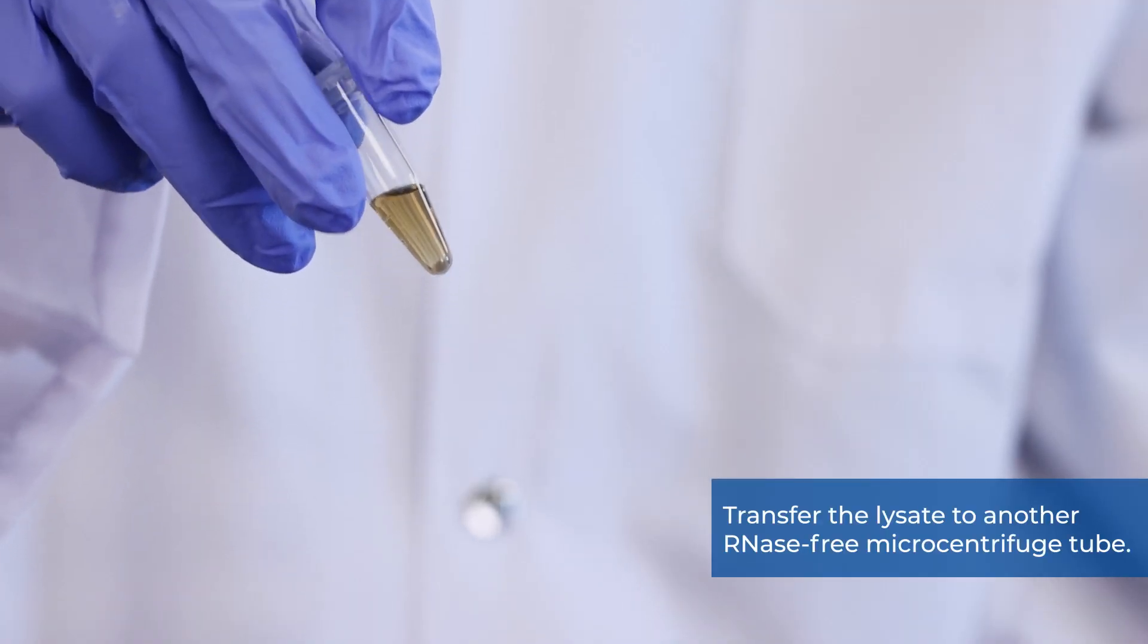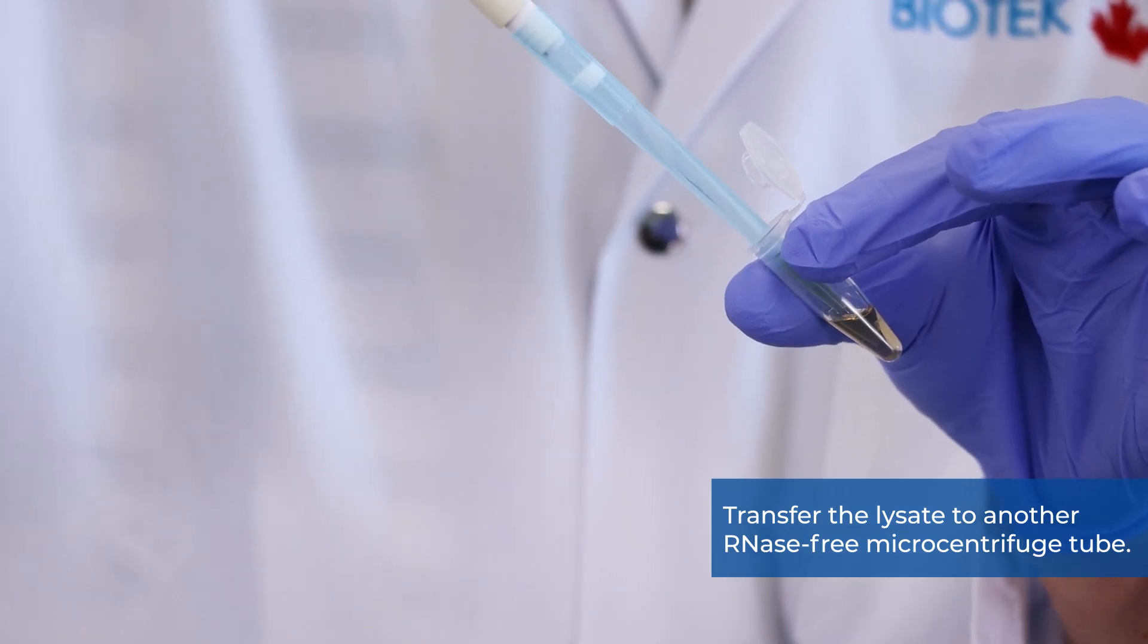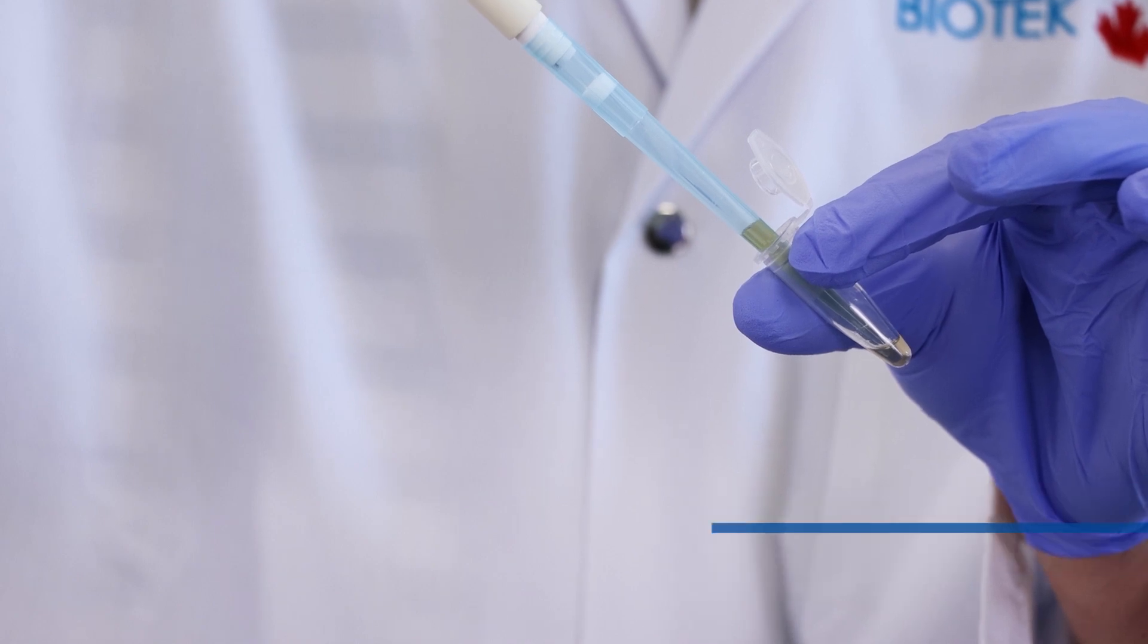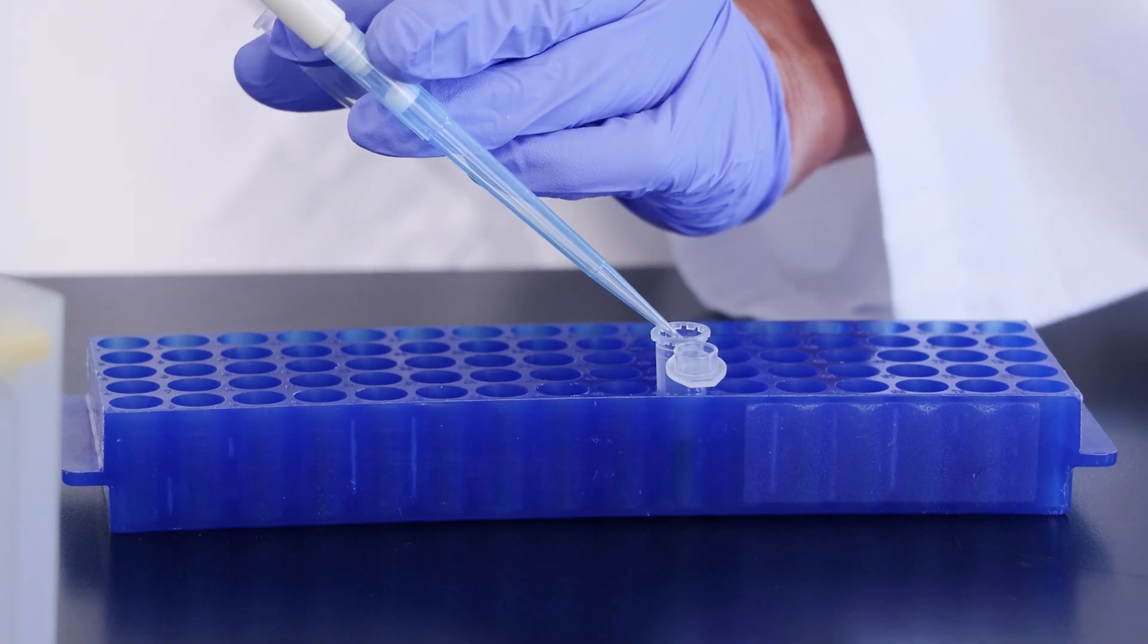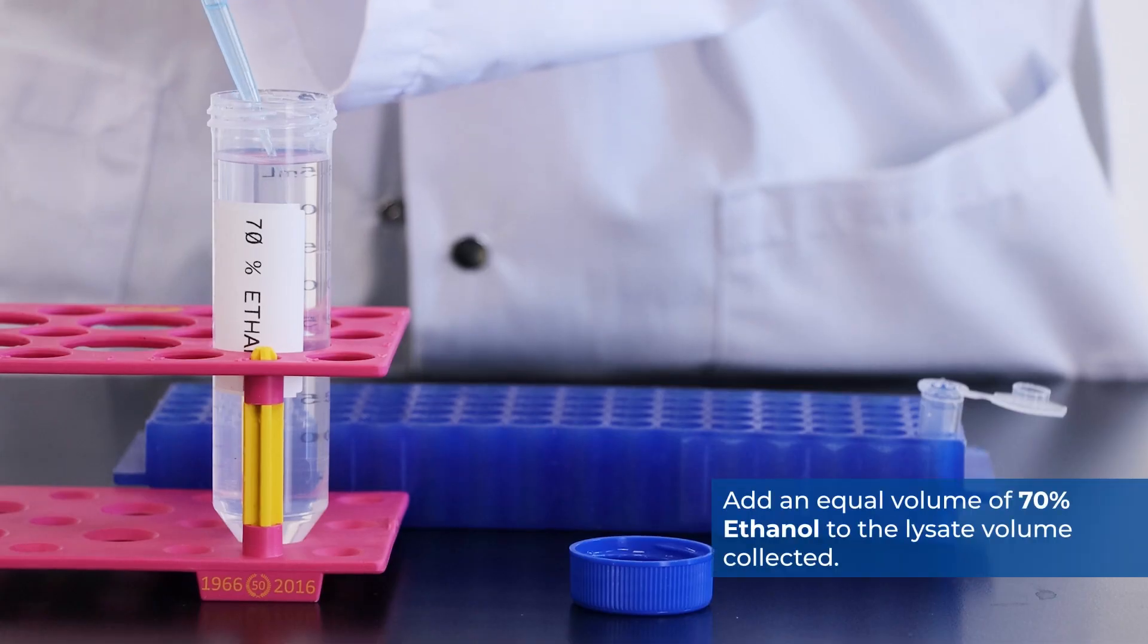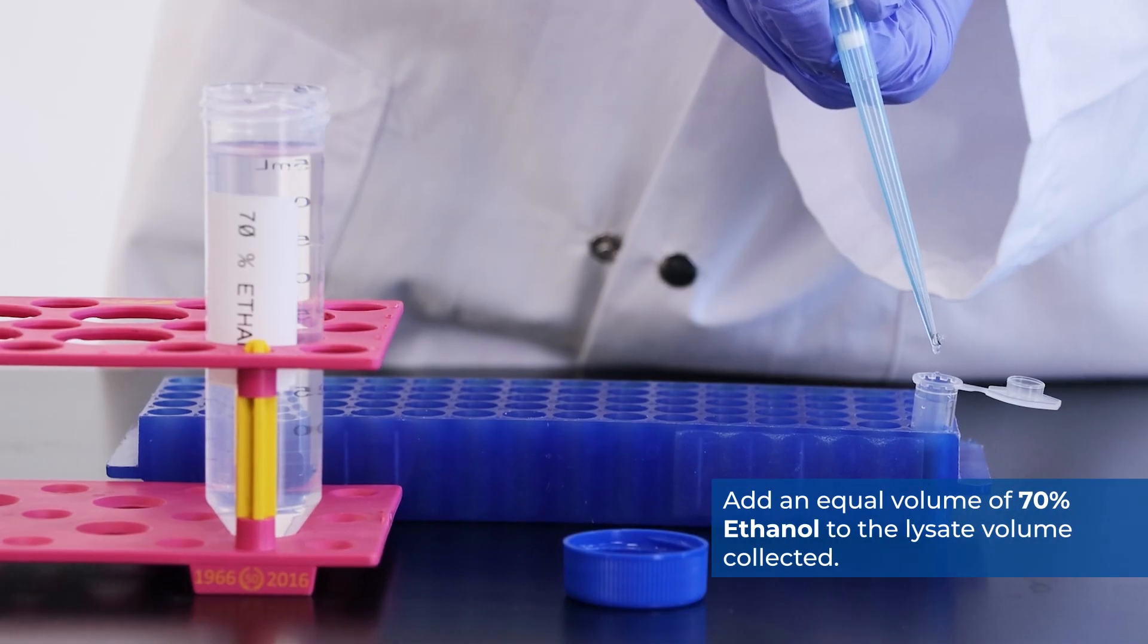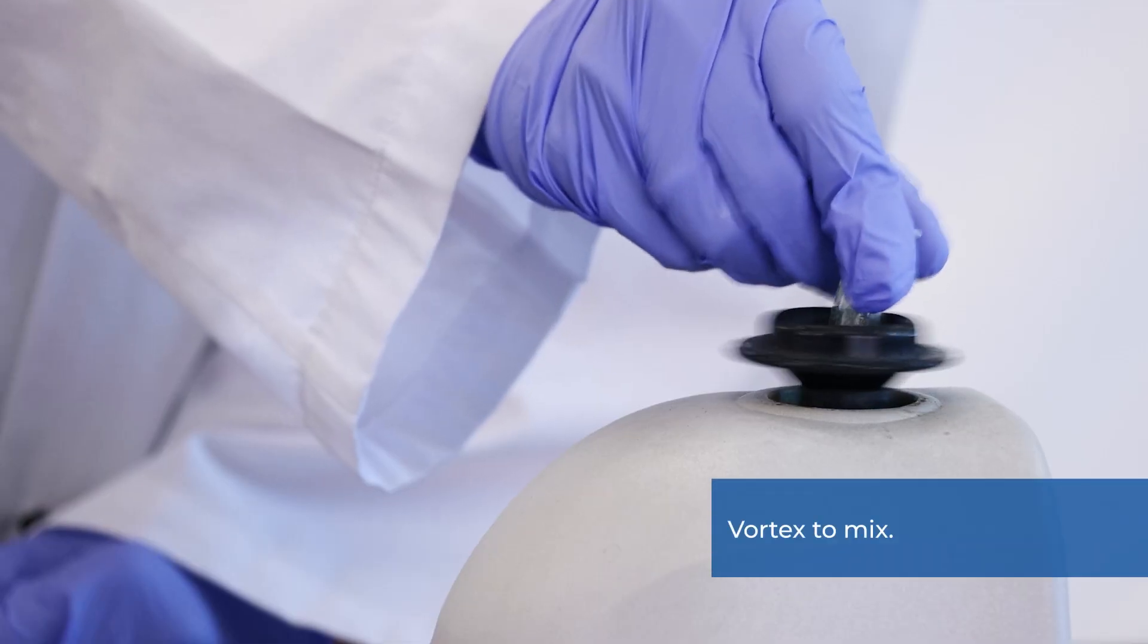Transfer the supernatant to another RNase-free microcentrifuge tube. Note the volume of the supernatant or lysate. Add an equal volume of 70% ethanol to the lysate volume collected. Vortex to mix.